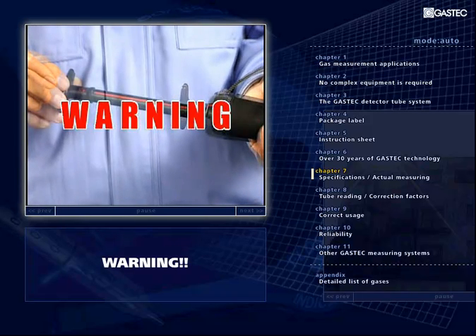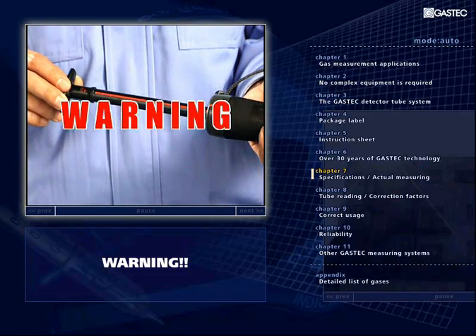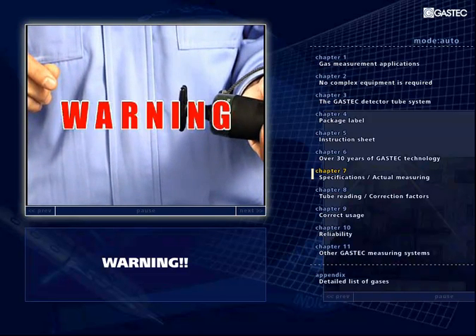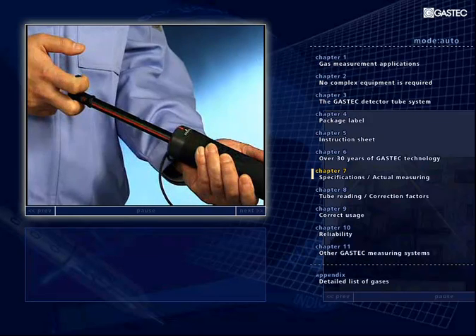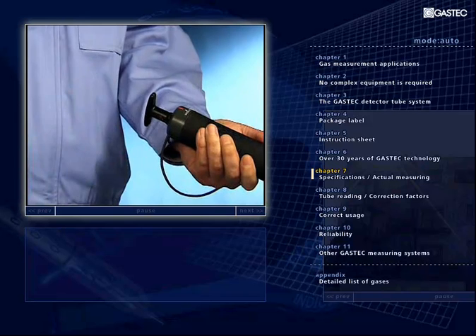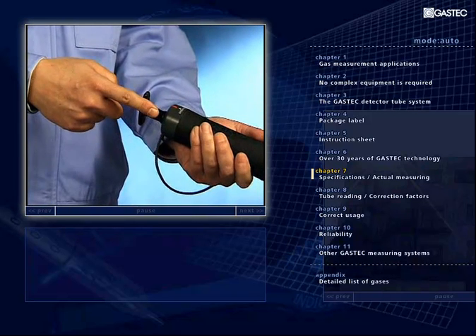Be sure to guide it back gradually by applying a little resistance. Otherwise, the handle will spring back due to the vacuum in the cylinder and possibly damage the pump or cause injury. The airtight condition of the gas sampling cylinder is ensured when it returns to the position where the red line cannot be seen.